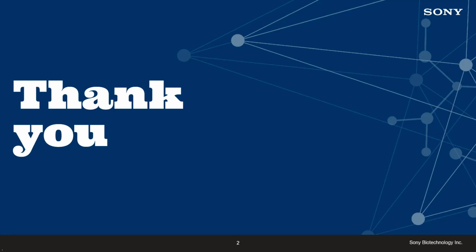Those kinds of workflows are well reported on, but again, you're going to have to optimize a workflow that works best for you. Probably a good opportunity to reach out to an FAS, reach out to us here at Sony. We can provide guidance. Every tissue is different. The stickiness, the viability is always variable in tumors. So a little tweaking of protocols and optimization is probably warranted. Okay.